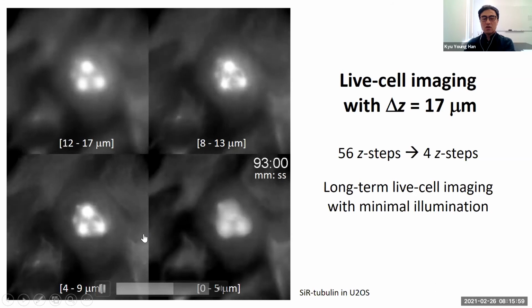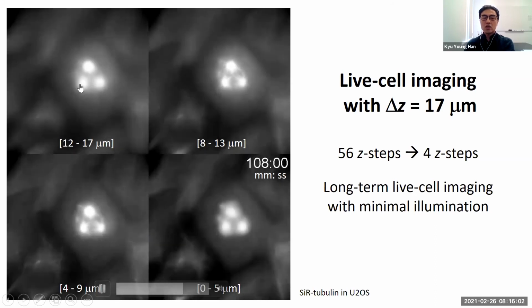But this sample is a little abnormal because we can see the spot here.